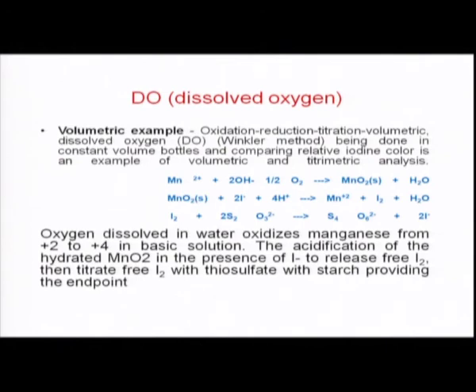The other parameter normally determined in water is dissolved oxygen, DO.